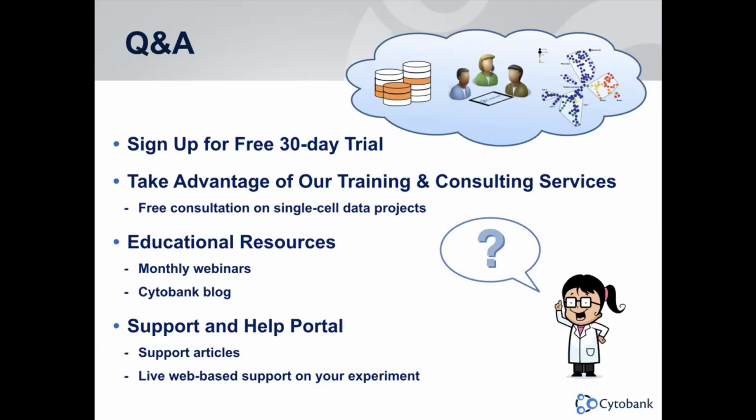So I do have another question for Dr. Belkina here. He asked that in your workflow, after compensation and before getting into the steps using Cytobank, you have the quality assessment step. What are some of the QAs that you do? Do you have a checklist of these?